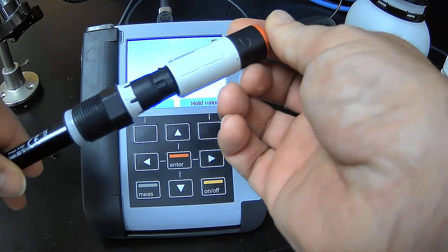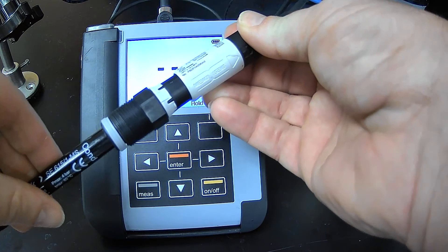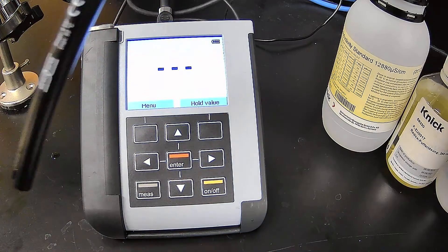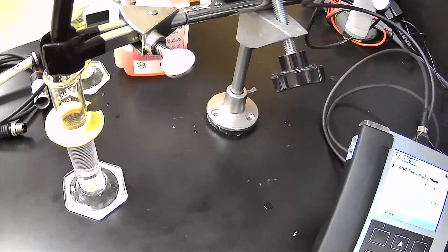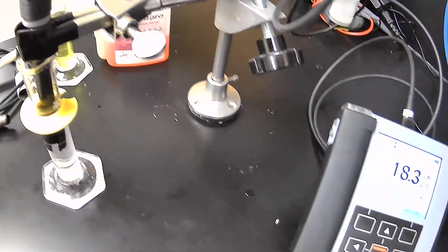The way we do this is we use the bayonet connection, the memo sense inductive connection. What I'm going to do is put it into the conductivity solution that I've already prepared.